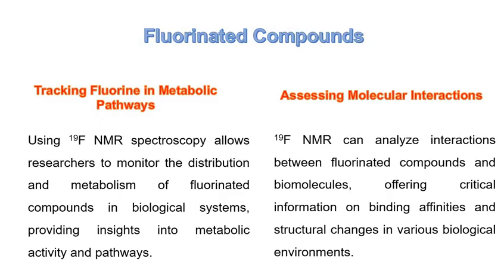Assessing molecular interactions, F19 NMR can analyze interactions between fluorinated compounds and biomolecules, offering critical information on binding affinities and structural changes in various biological environments.